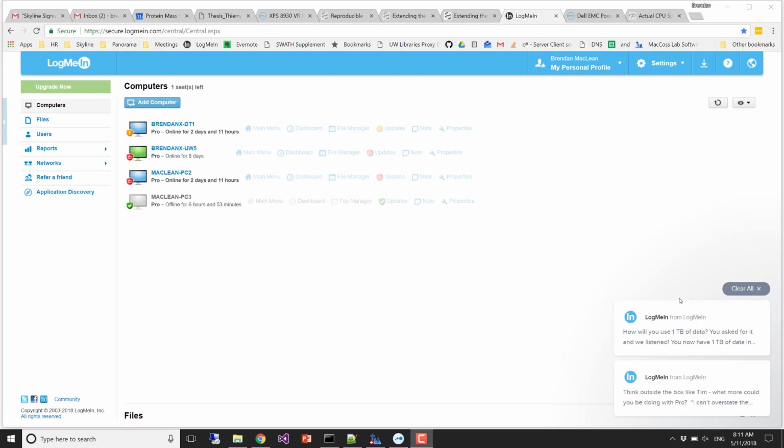but it also loses some of the original information, like what was the originally measured retention time? Show me all the noise in the spectra. It's very specific for its purpose.